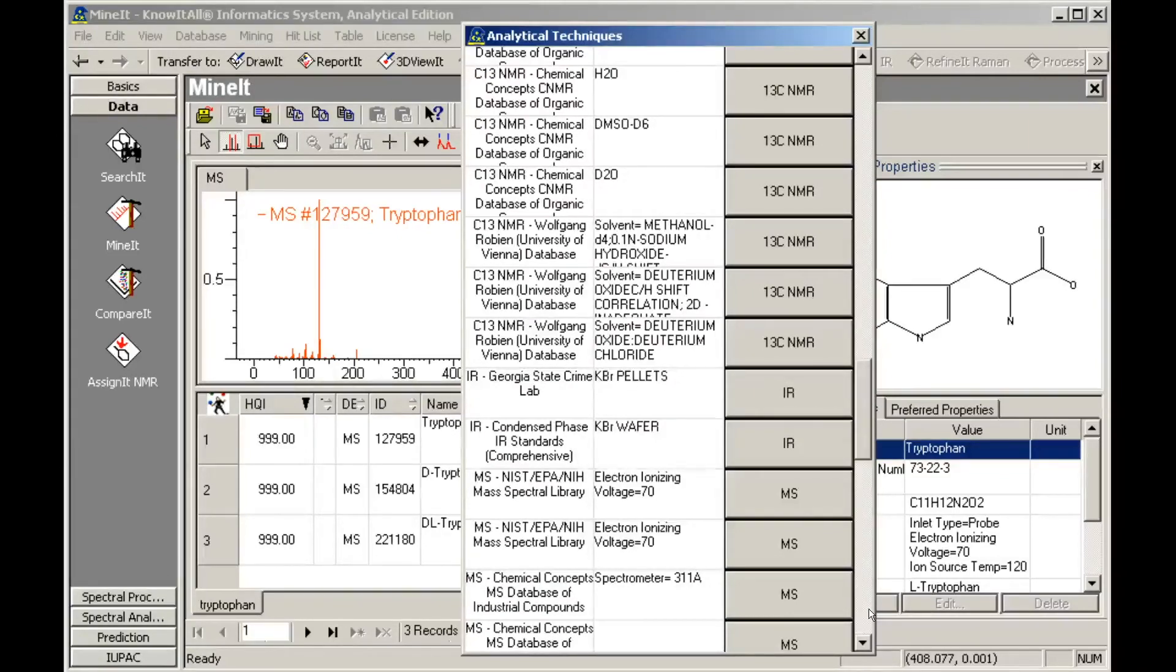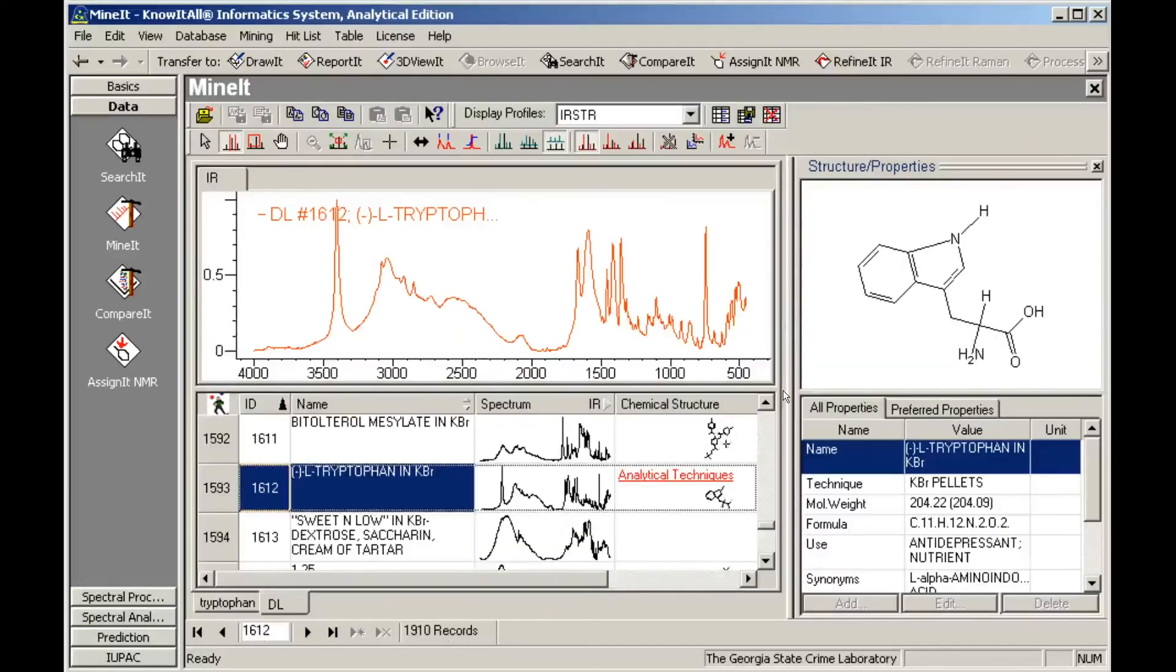Let's examine one of the IR spectra. The appropriate database opens in the Minet application to the record of interest.